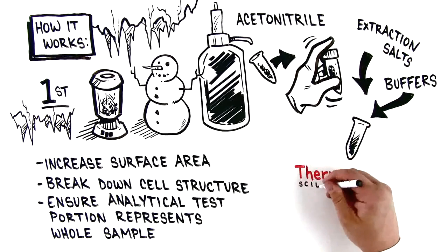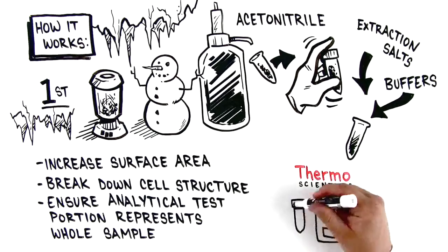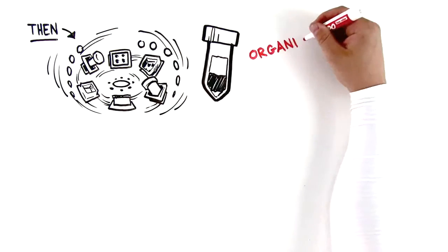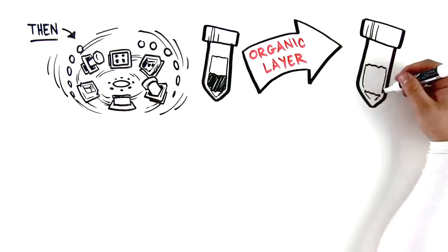For this step, you can use ThermoScientific prepackaged salts and centrifuge tubes. Then, centrifuge the tube to separate the organic layer, and transfer the organic layer to another centrifuge tube for the next step.